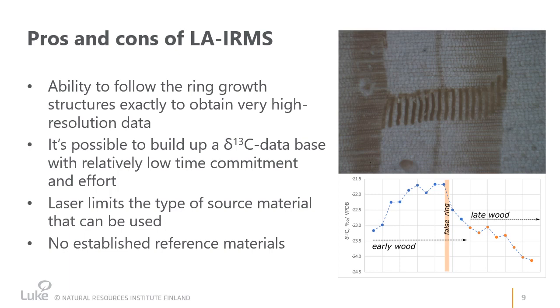Because it's also an online method, it's possible to build a large carbon isotope database with relatively low time commitment and effort compared to conventional methods. So you can basically do more with less time.